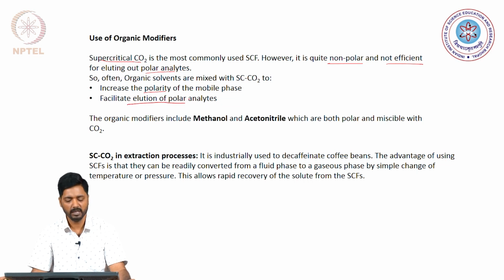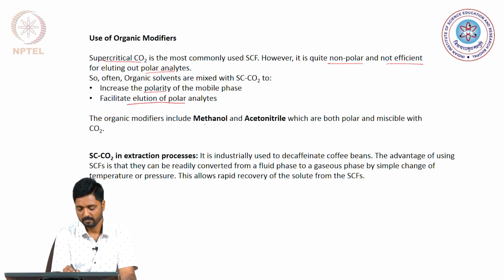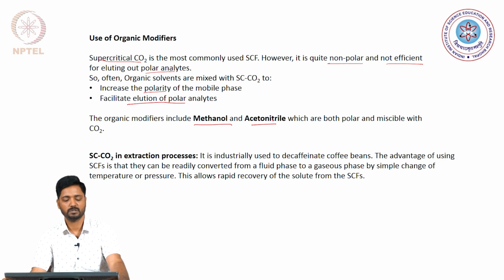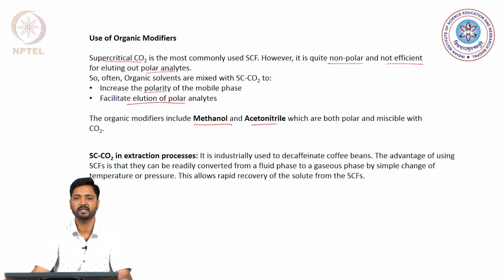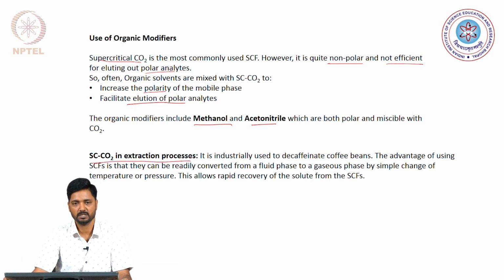Now, the most common organic modifiers or organic additives being used with supercritical carbon dioxide are methanol and acetonitrile, which are both polar and miscible in carbon dioxide. Because of its unique nature and easy conversion from a supercritical phase to a gaseous phase, supercritical carbon dioxide is also used in extraction processes in industry.